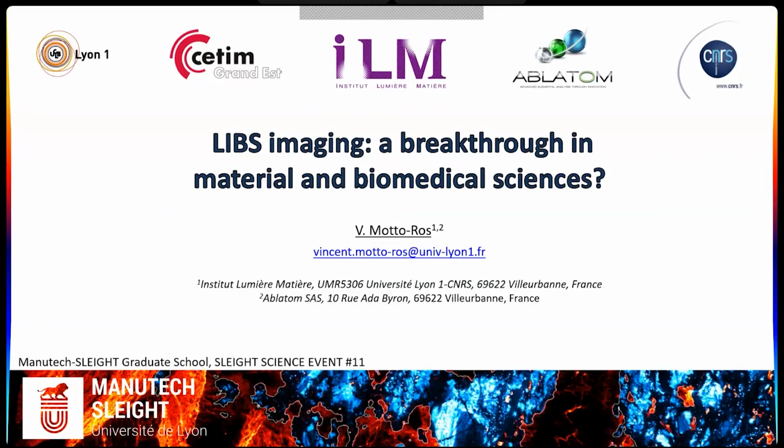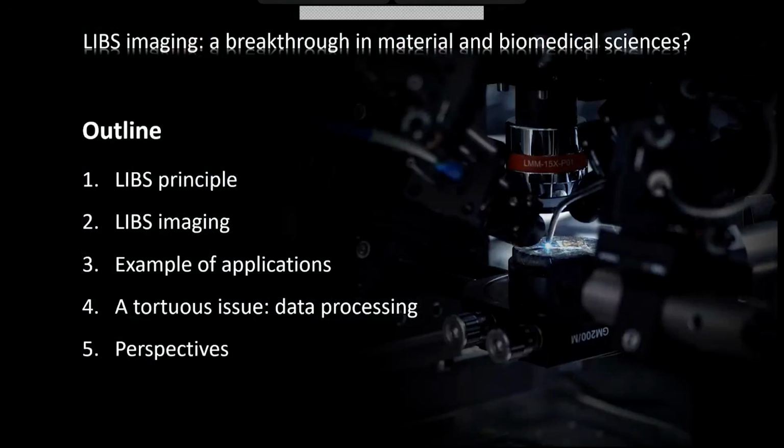Okay, so let's talk about LIBS. I don't know if you know what LIBS is. LIBS is laser-induced breakdown spectroscopy. Laser-induced breakdown spectroscopy, spectrométrie de plasma induit par laser in French.